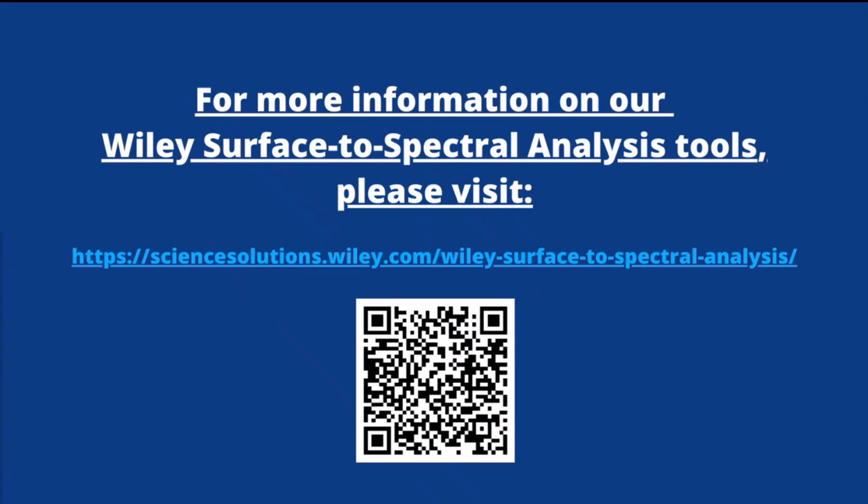All right, have a few more coming in. How about this one? Why would we need to use KnowItAll specifically with this software product? So KnowItAll is a tool for spectral comparison and analysis. It has a long history of providing accurate and fast spectral library searches and is used worldwide across a wide range of application areas.